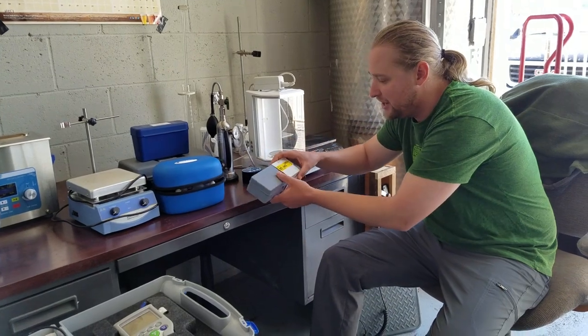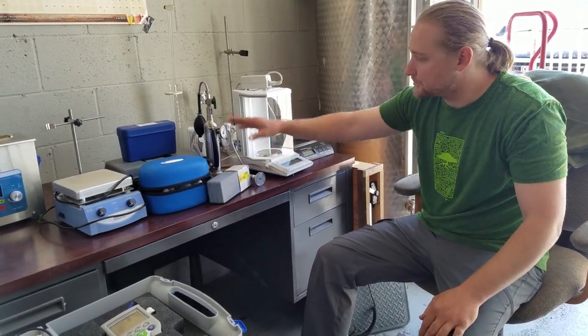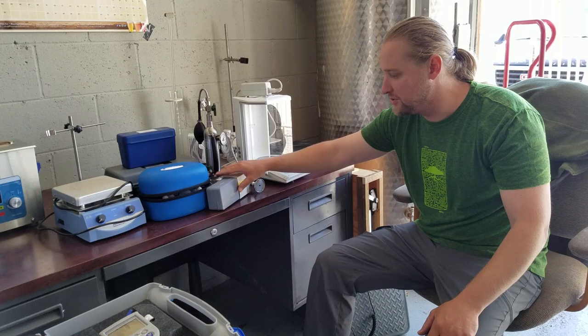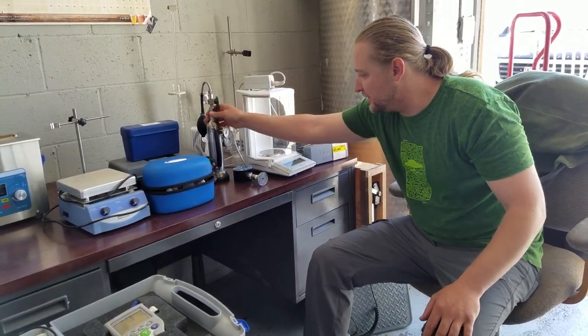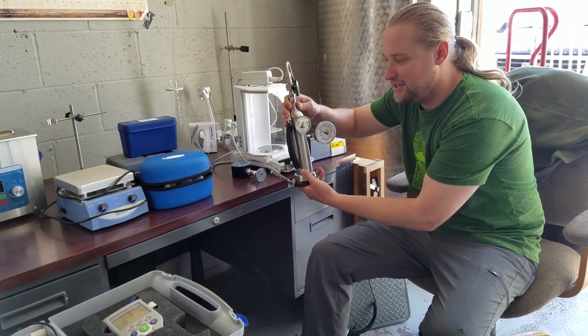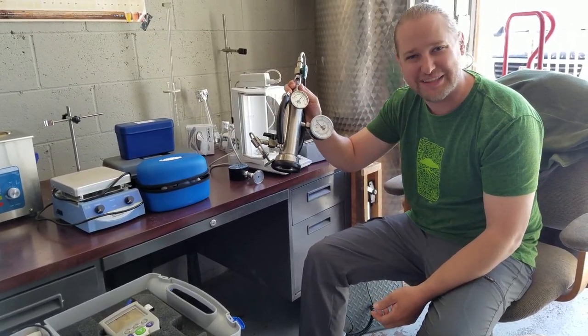We have a refractometer here — you can use this to check gravity, and we also use it to check our glycol dilution. In your chiller, your glycol has to be a certain ratio to the water, and you use the refractometer to check that. Here's our SS-60 zomnagel — that's how you test carbonation. I've done a video on it if you want to check that out.